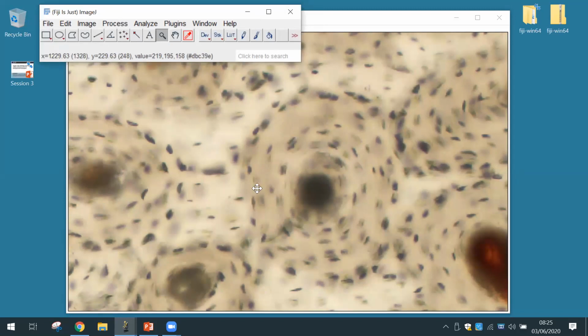What you'll find is these black dots are actually osteocyte lacunae, which we'll talk about next week. If you don't see a very distinct cement line, these black osteocyte lacunae arrange around the periphery of the osteon. If you take a look at this one here or that one, you can see that they're more horizontal. That's already indicating that the bone around here no longer belongs to that one secondary osteon.